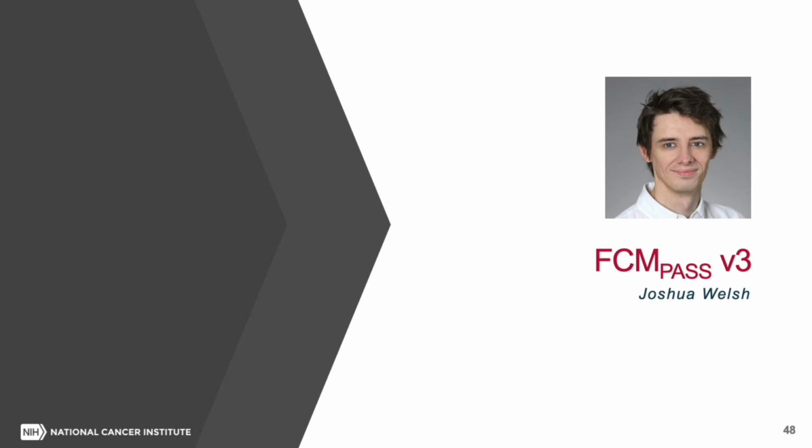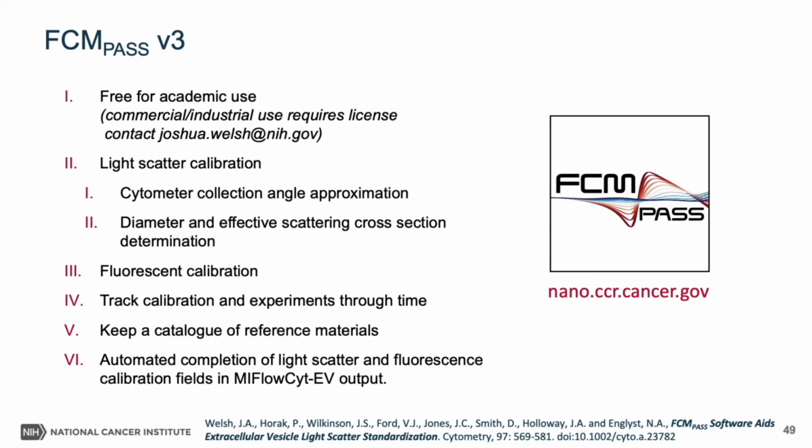Hello again. I'm now going to show you the latest release of the FCM-Pass software. As well as performing light scatter calibration, this software allows you to perform fluorescence calibration and create automated MIFlowCyt-EV reports of your experiment with respect to the calibration and characterization fields.